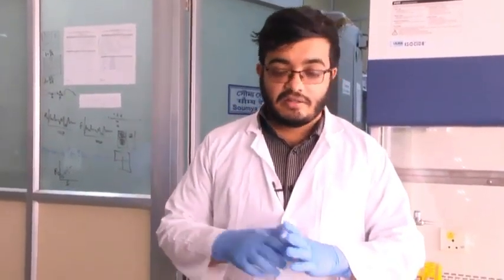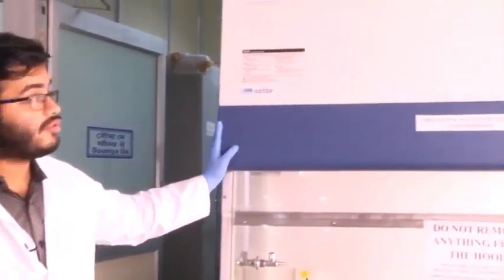So before we move on to new experiments and learn new techniques, what I'd like to do is show you some of the common instruments that are available in any well set up molecular biology and biochemistry laboratory. So first of all, I'd like to show you this instrument here.